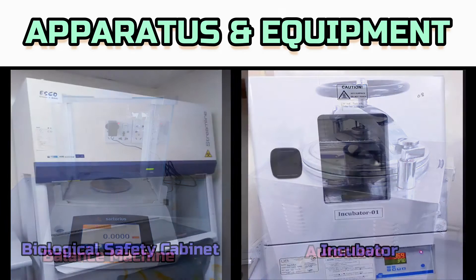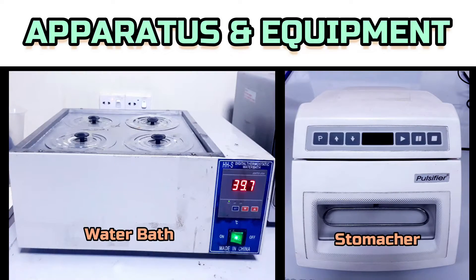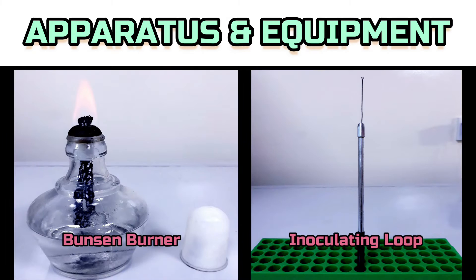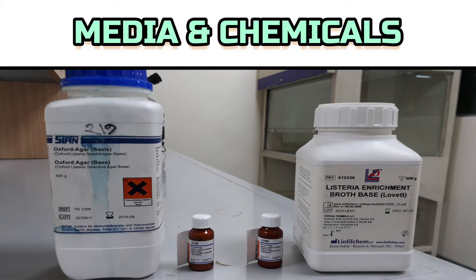To conduct this test we need a balance, autoclave, biological safety cabinet, incubator, water bath, stomacher, micropipette with tips, Bunsen burner, inoculating loop, sterile Petri dish, stomacher bag, Oxford Agar Base, Listeria Enrichment Broth Base, and Listeria Selective Supplement.